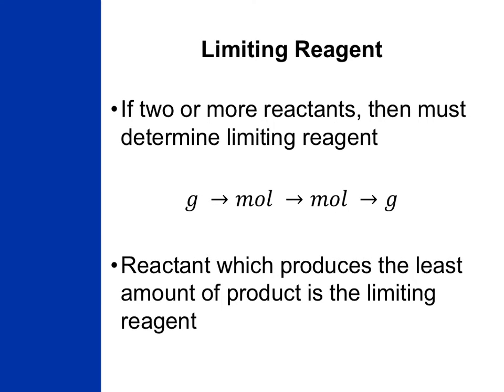When we're looking at chemical reactions, we have to do some calculations to determine what the limiting reagent is. You did the same thing with the sandwich analogy, only you did that math in your head. The first thing we need to do is convert from our starting unit, whether that's grams or milliliters, to moles. Once you're in moles, you can switch between different substances or reagents using the balanced chemical equation. So you'll always want to make sure that the chemical reaction is balanced before you begin.